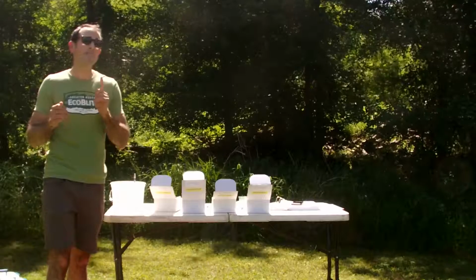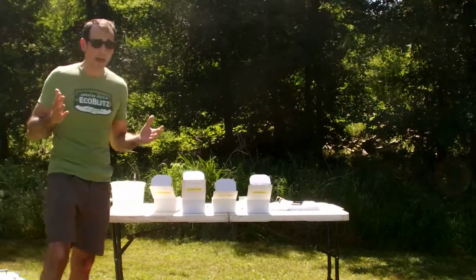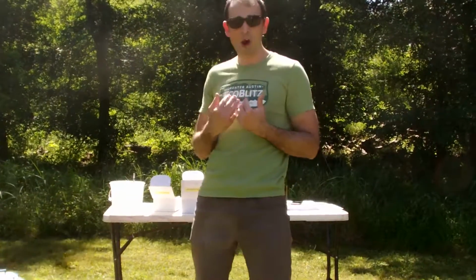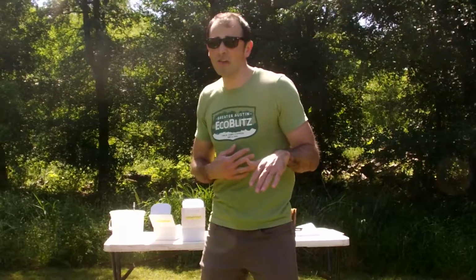Next, what we're going to do is measure dissolved oxygen. Now, dissolved oxygen is super, super important, right? Because dissolved oxygen is another one of those reasons it's going to tell us how healthy our water is or isn't. So, high degrees of dissolved oxygen for great aquatic life and aquatic growth. Low degrees of dissolved oxygen, that's right, you named it, not a lot of aquatic growth, okay? So hopefully we ran somewhere in the middle.